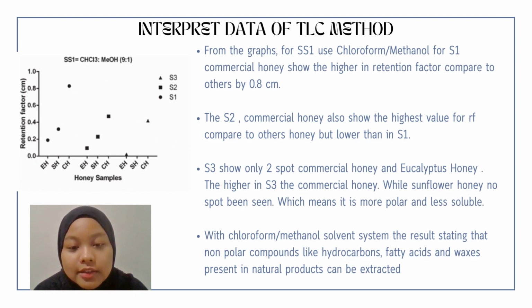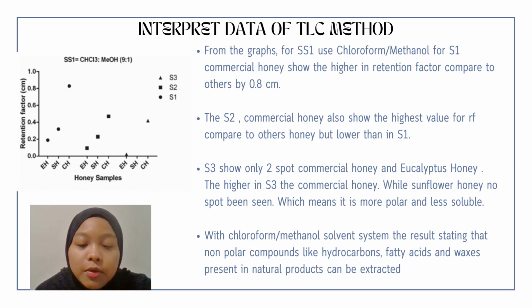By interpreting the data using the TLC instrument for food analysis, which is honey, using different solvent systems, we get better resolution of components. Basically, in the crude extract of honey, an impressive diversity of chemical constituents can be seen. They were observed under short and long wavelength light. Prominent colored bands of different crude extracts were observed by staining with anisaldehyde and also observed under UV.